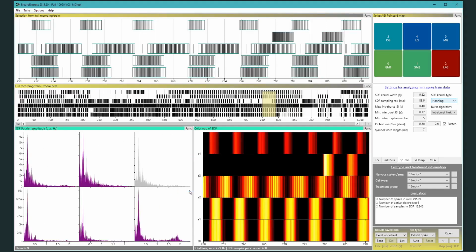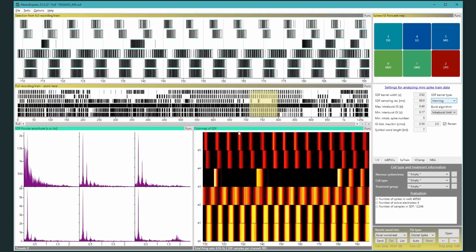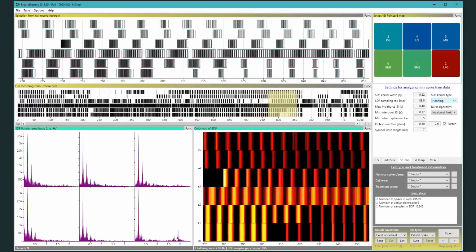Well, the Fourier analysis of the spike density is very useful because these graphs will show the periodicity and regularity of the network oscillations in this network. But they will also show the frequency modulation arriving from the faster pyloric neurons. These are shown by these peaks around 2 Hz in the Fourier spectra.